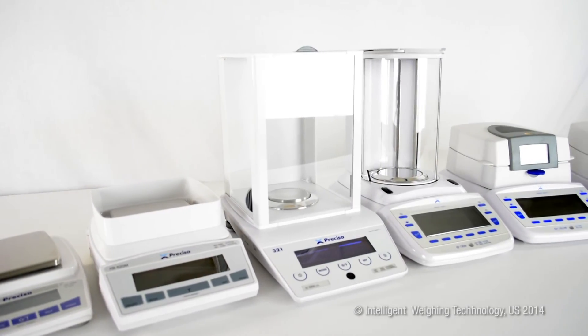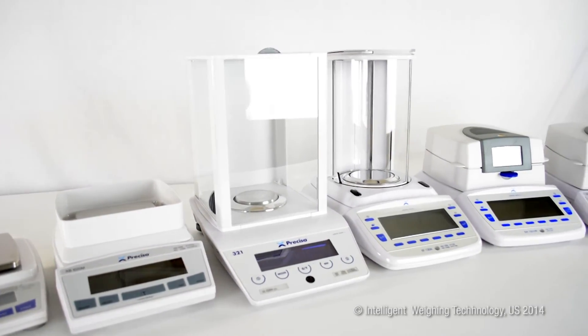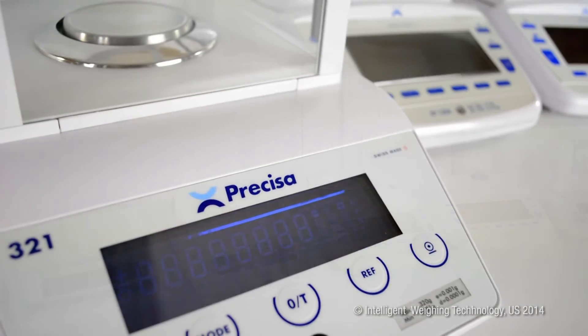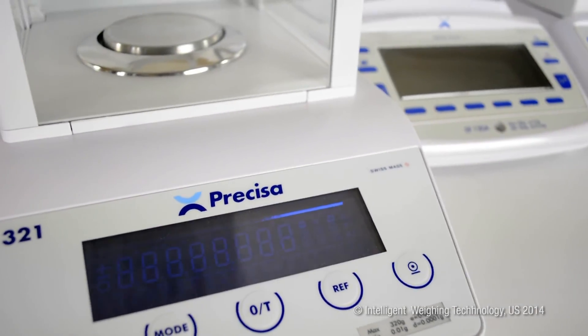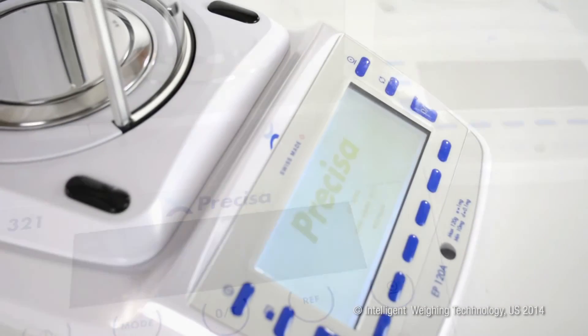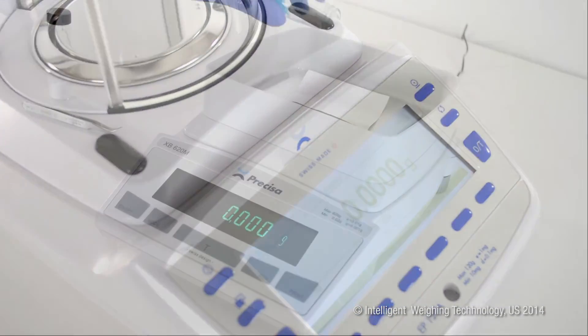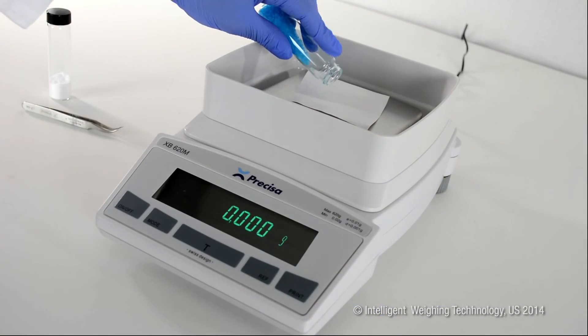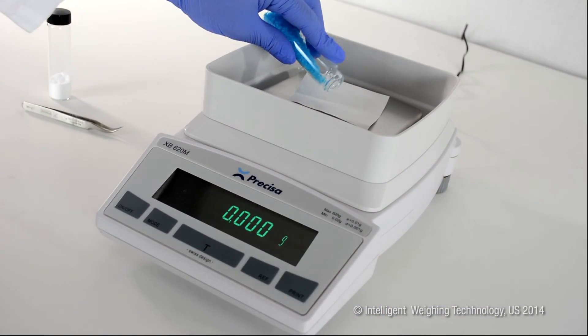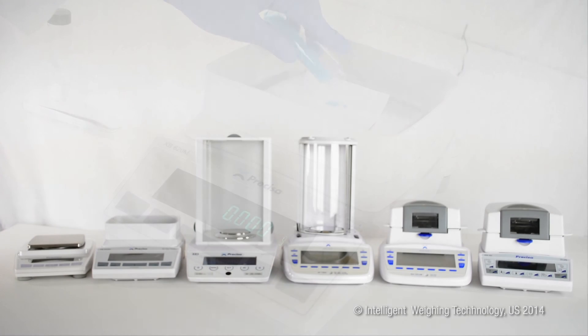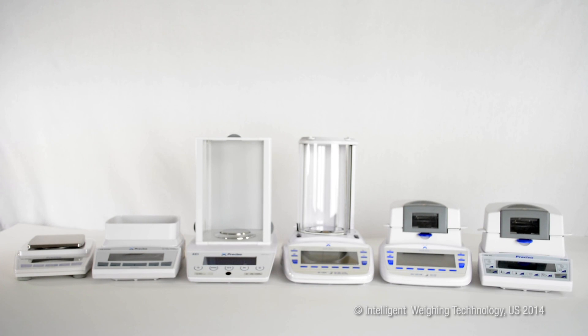Precisa offers cost-effective solutions for high-performance industrial and laboratory applications. Consider Precisa for your mission-critical weighing applications that require versatility, connectivity, and absolute accuracy.